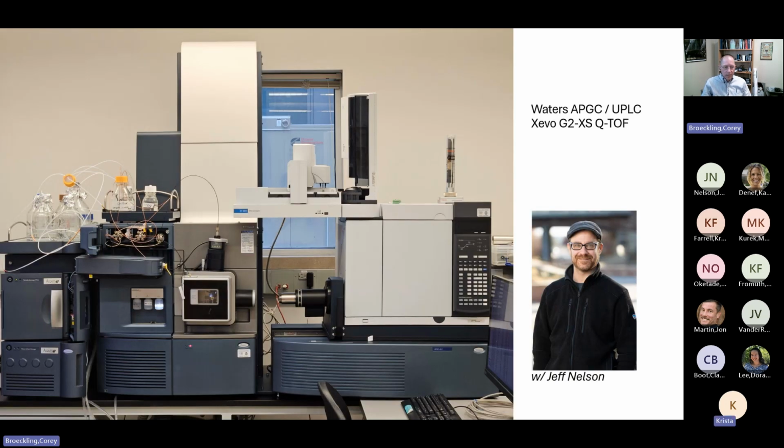So I'm going to start by talking today about this interesting instrument. It's a gas chromatography system, Waters APGC, coupled to a Q-TOF. And what you can see, let me select my laser pointer here, is on the right side of this instrument is the gas chromatography system. And on the left side, we actually have a liquid chromatography system. In the center is the quadrupole time of flight.